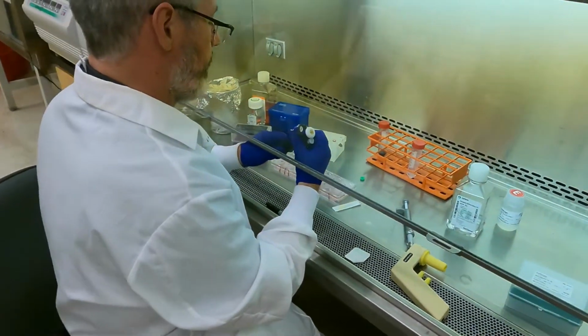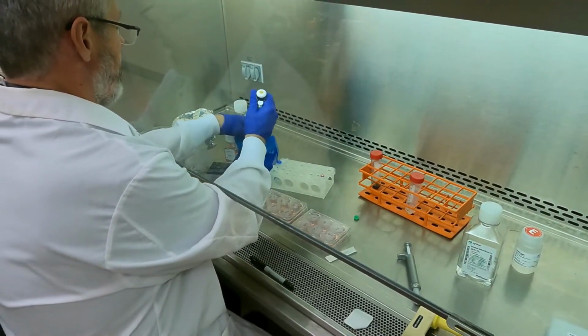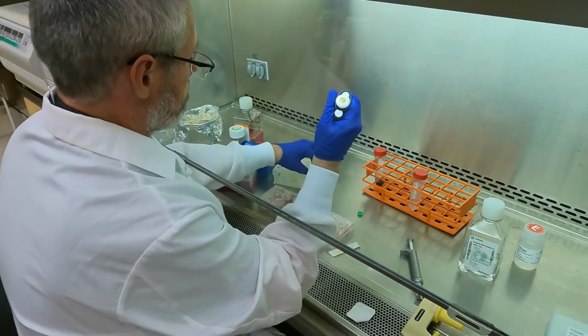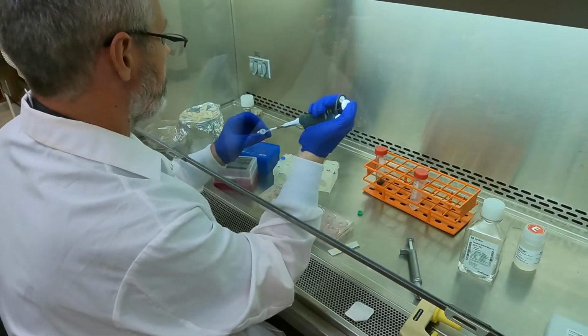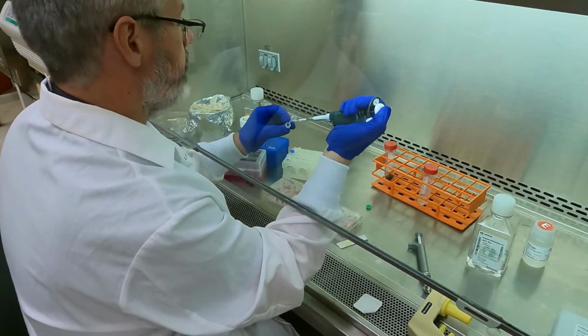I just want to make sure that the protocol worked, and I'm not going crazy here. It's only a straightforward GFP plasmid.